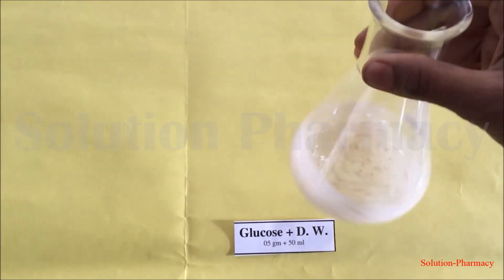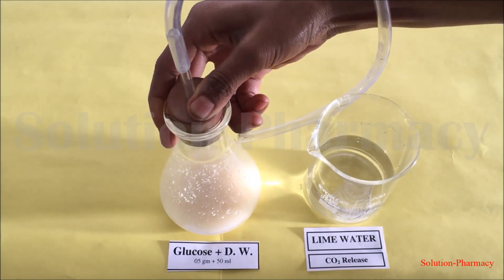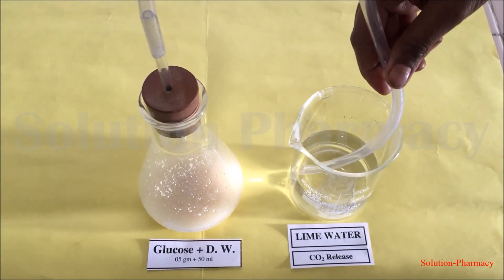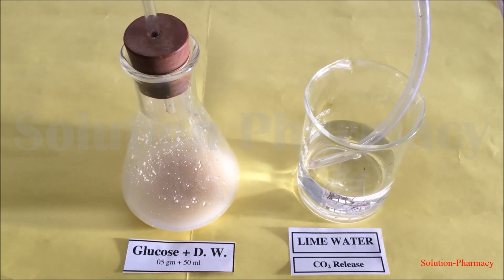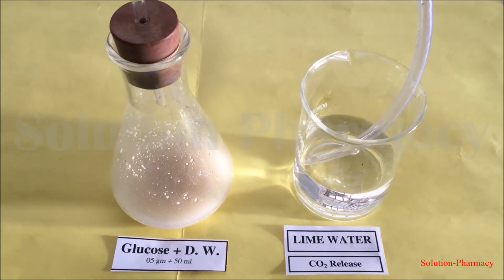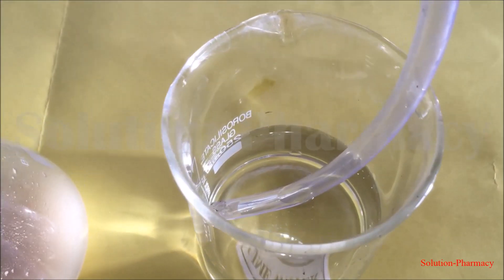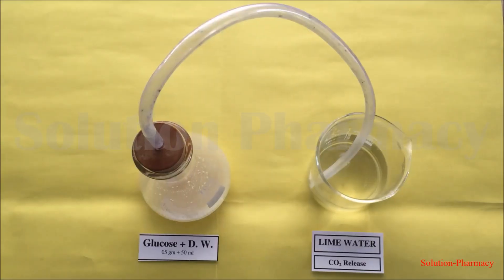To confirm the fermentation process — to verify that carbon dioxide gas is evolved — fix a cork in the mouth of the conical flask and apply a thin smear of petroleum jelly so that the flask becomes airtight. At the center of the cork there is a hole; insert a glass tube into it and connect a rubber tube to it, then dip the other end of this tube into freshly prepared lime water kept in a beaker.